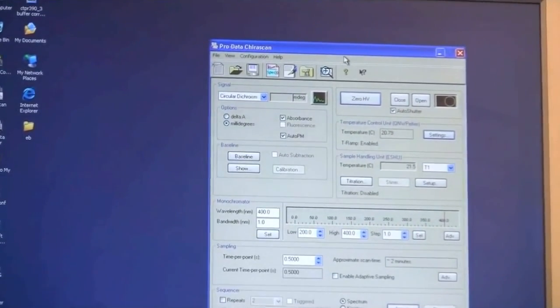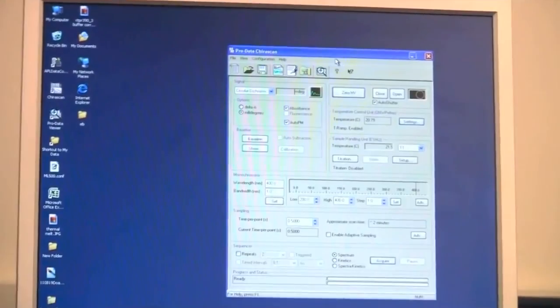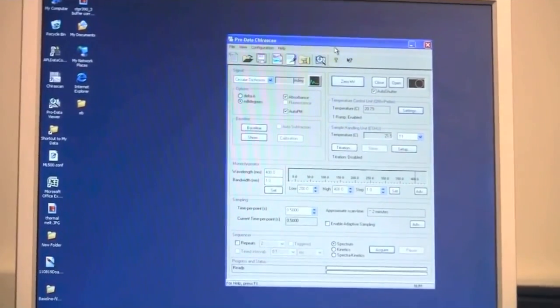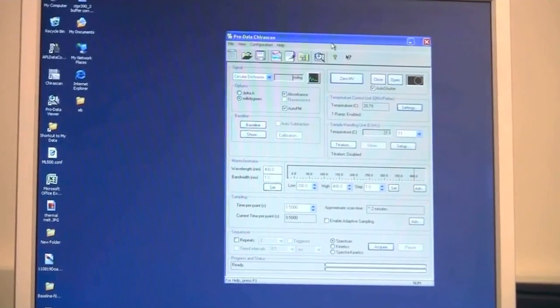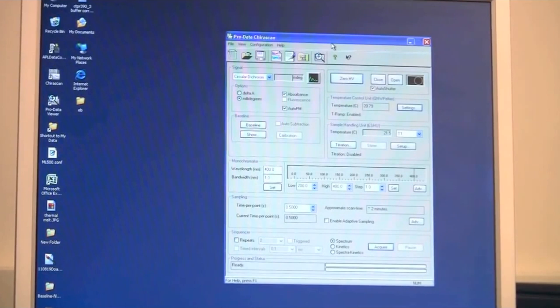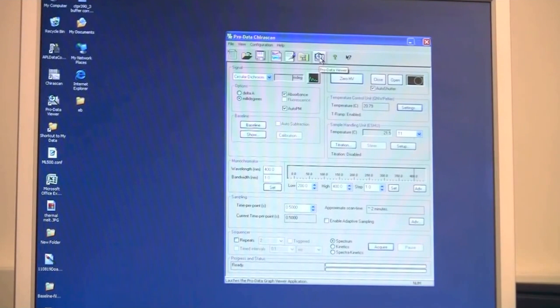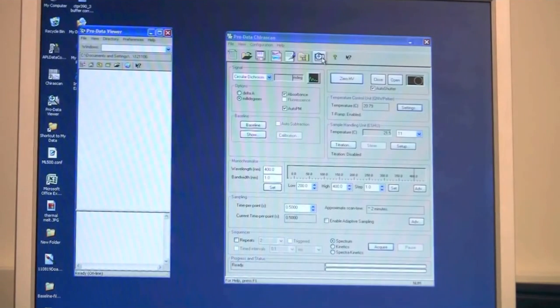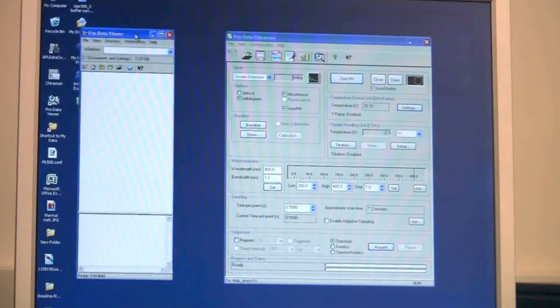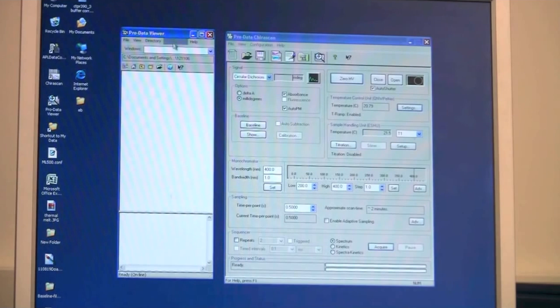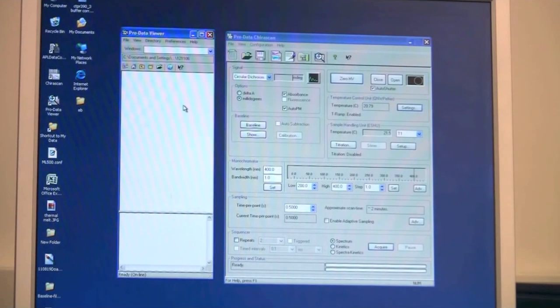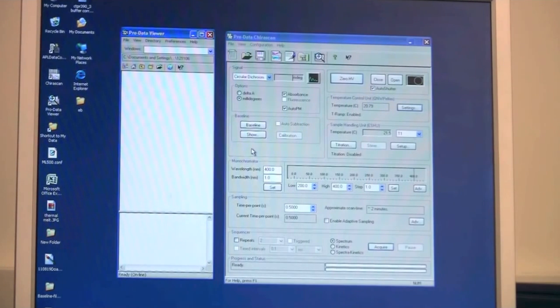When you open the ProData Viewer that always have to communicate with this software. Therefore I always open ProData Viewer from within this software using this icon. I click and it opens. It is very important that these are communicating because the ProData Viewer defines where you save your data. If they are not communicating and you are acquiring data the software will not know where to save it and you might lose your data.